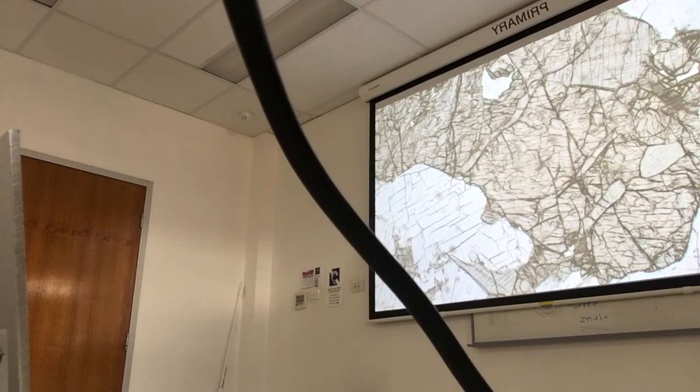So this thing had two pyroxenes when they crystallised from the melt, but they weren't augite and hypersthene, they were pigeonite and this subcalcic augite. And now they've exsolved, the bulk compositions of each grain is still what it was when they crystallised, but in the solid state within the grain, the two end members have gone their separate ways because they don't like to be with each other when the temperature's lower. Okay. So yeah, classic, you won't see better exsolution textures in pyroxene than what's in that slide. They're fantastic.